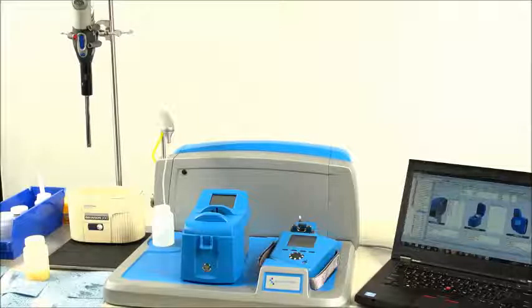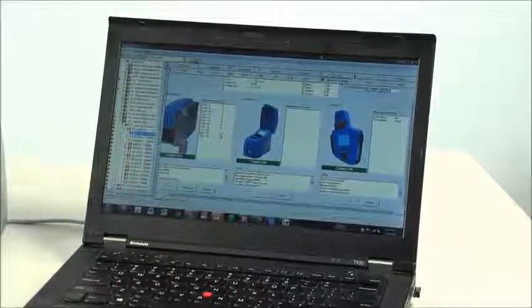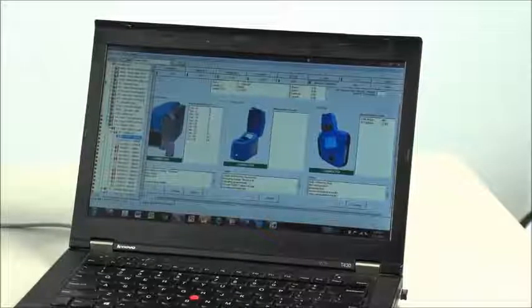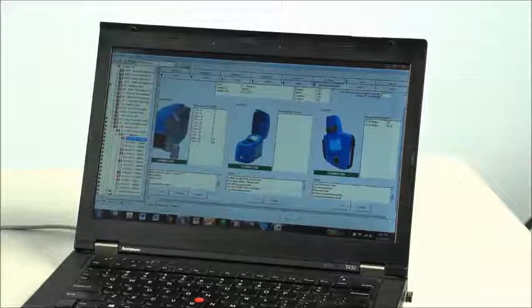Simply select continue from the screen. Once the results are complete, you simply select save, and again it will transfer data into AMS. The data from the 3 instruments are now recorded into the AMS Machine Health Manager OilView LIMS database. From the database, one can look at sample results.